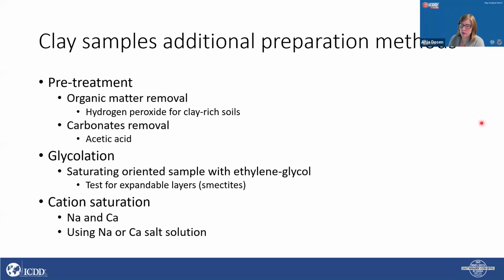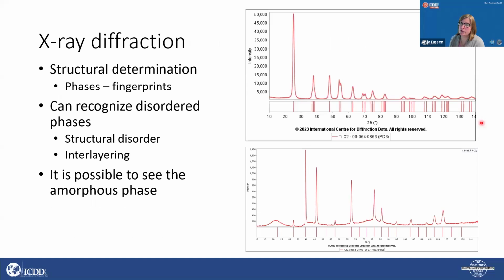Also, we perform cation saturation, and I'm going to be showing sodium and calcium saturated samples, which also influences the appearance of their X-ray diffraction pattern, and that also helps in characterization and clay determination. So, talking about X-ray diffraction as a focus here.